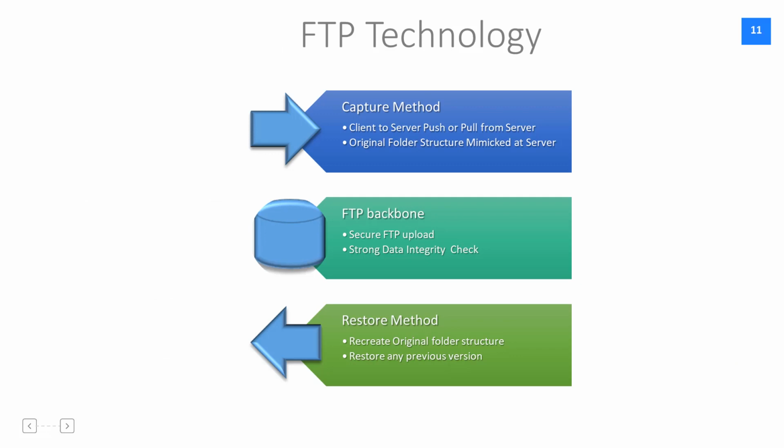Logilab SDMS uses FTP technology as the backbone for storing all its data in a central repository. The instrument data capture method can be push or pull. There are several instruments where Logilab SDMS monitoring services cannot be installed. Let's say, for example, the old XP operating system.